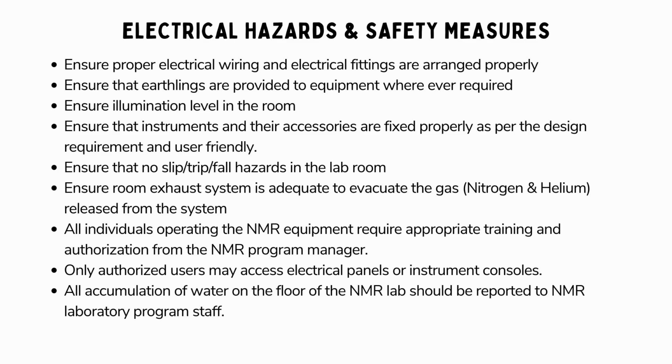Verify that the room's exhaust system is capable of expelling gases such as nitrogen and helium effectively. Individuals operating NMR equipment must receive proper training and authorization from the NMR program manager. Access to electrical panels or instrument consoles is restricted to authorized personnel only. Report any water accumulation on the floor of the NMR lab to the program staff immediately.